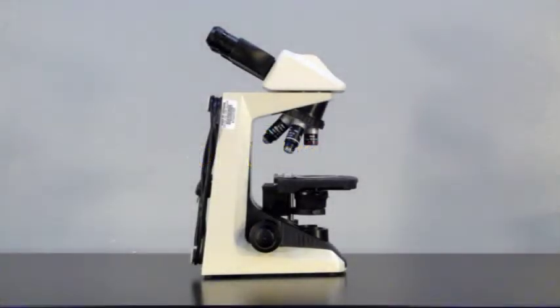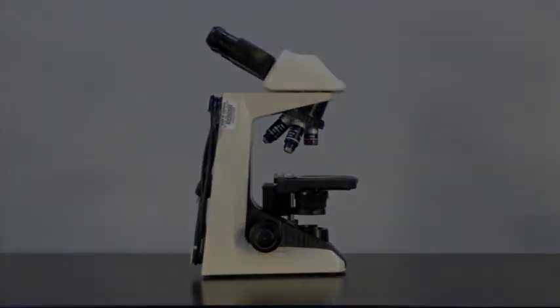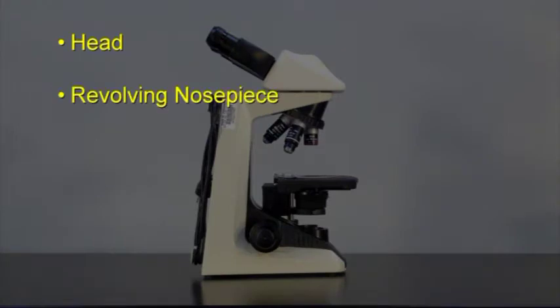The major structures on the microscope include the head, revolving nose piece, arm, mechanical stage, and base.